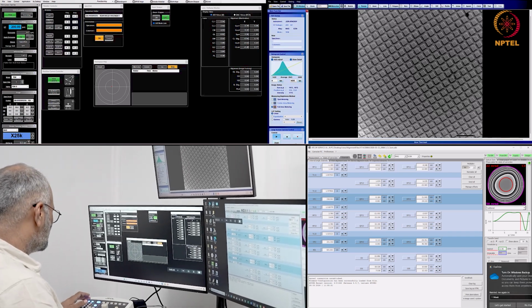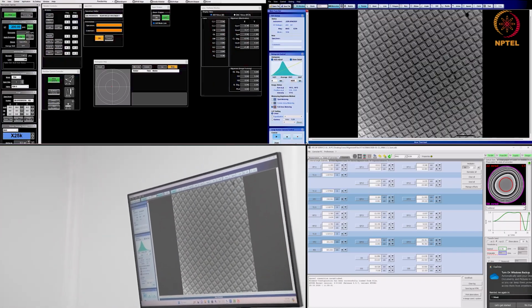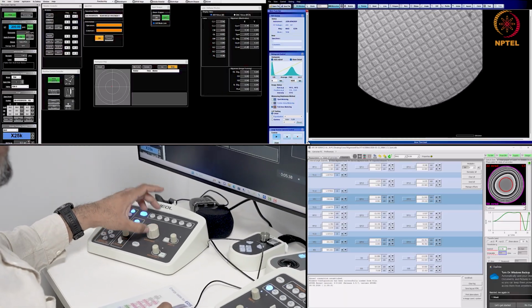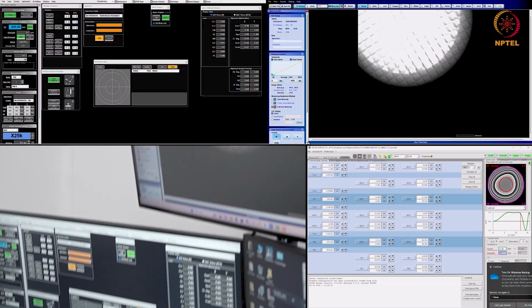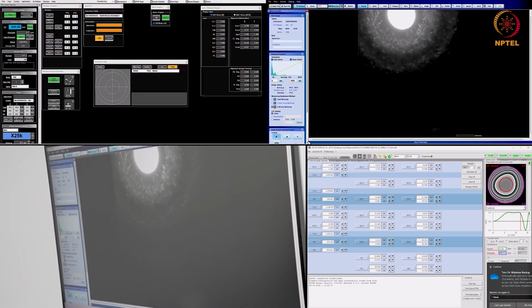So what I do is I click on the CL1 button, and it is in open state now, and I insert the CL1 aperture. You see the CL1 aperture is now inserted, and if I click on the brightness button here, the amplitude at which the brightness or the intensity is changing is varying. I see the beam is not centered.